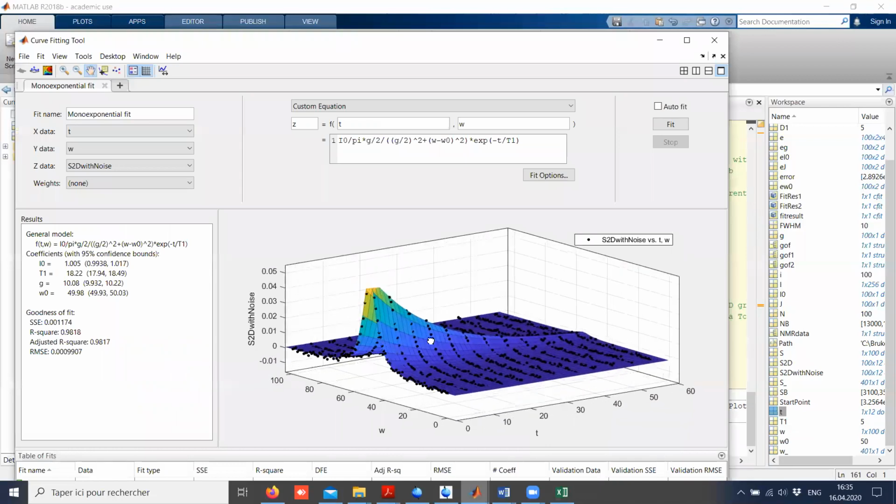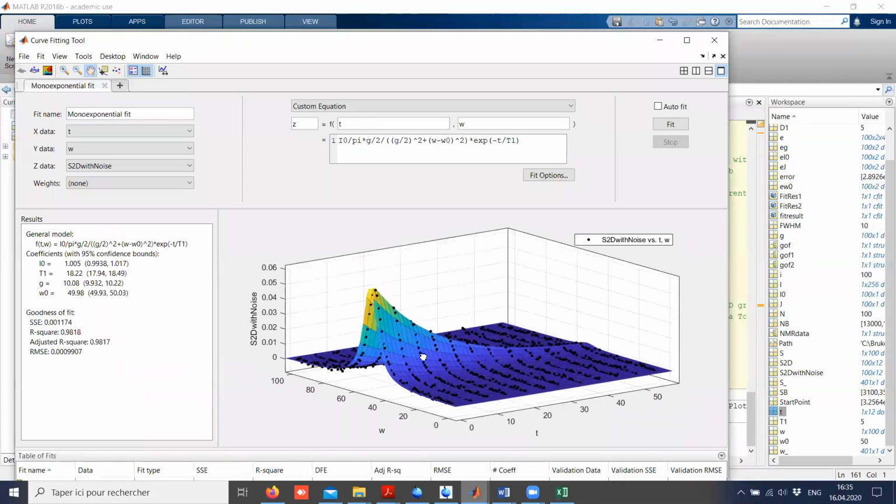So rather than plotting all the parameters one by one, what we did earlier, so we fit all the Lorentzians one by one, and then we fit this I0 as a function of time, we can just fit everything at the same time. And the great advantage is if you think about the number of variables that we have here. We have 1, 2, 3, 4.